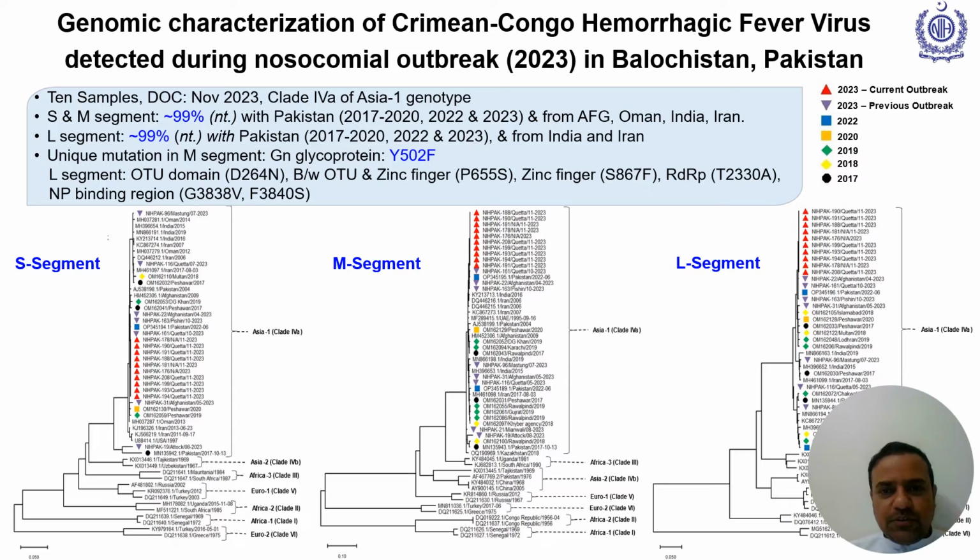So we also used it just recently in our province of Balochistan, where there was a nosocomial outbreak of Crimean Congo hemorrhagic fever. So Pakistan is endemic for this disease, and it's a highly lethal disease. So unfortunately, we do not have at the moment primers particular for doing whole genome sequencing of this virus.